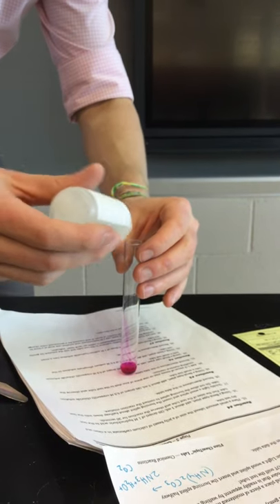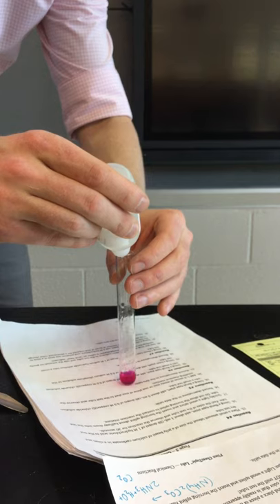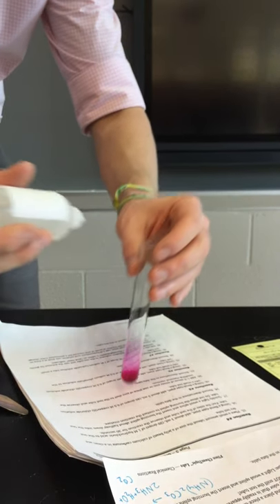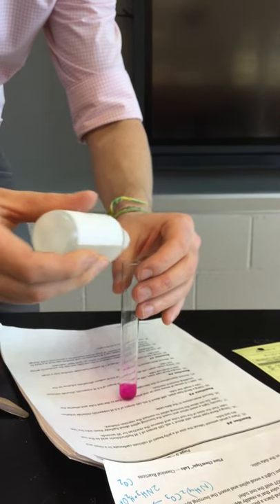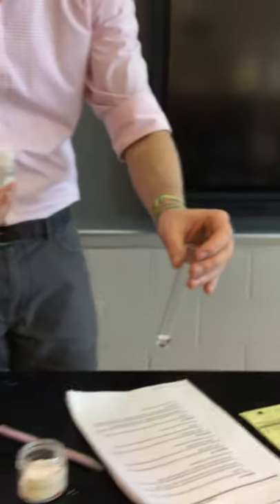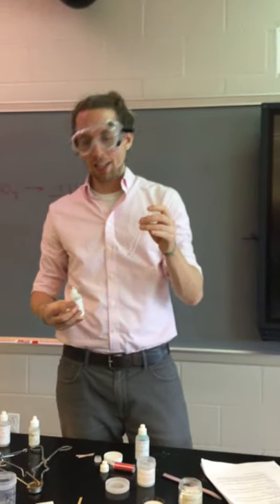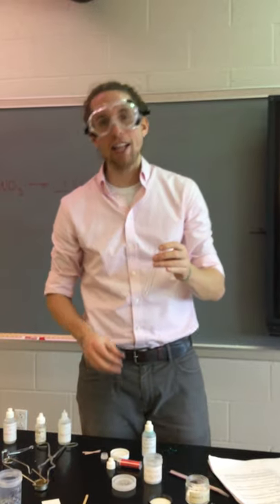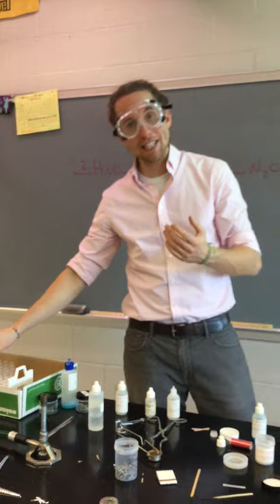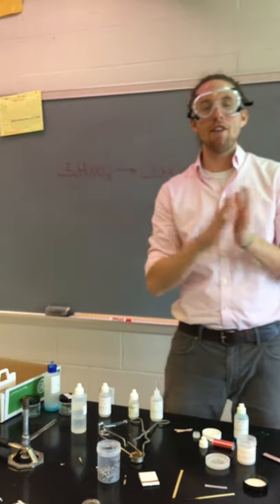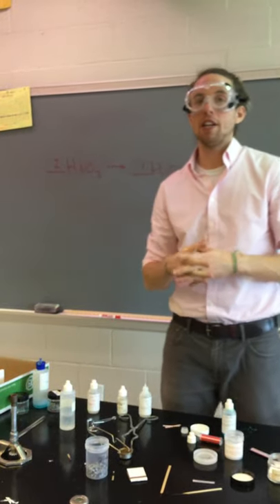All right, so we're going to count out our drops. Here's 1, 2, 3, 4, 5, 6, 7, 8, 9, 10. Let me give this thing a little swirl. Here's 11 and 12 and 13, 14, 15. Boom. And you saw how quickly that thing turned to clear. So all of a sudden, we immediately went from pink to clear. And remember that phenolphthalein is really specific in terms of acid or base. So what we did is we went from a base through neutral, pH 7, to an acid. And phenolphthalein is clear in acid. So that's why we saw that sudden pink to clear change.